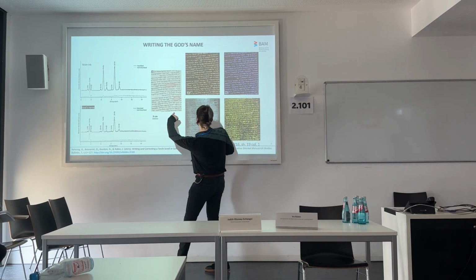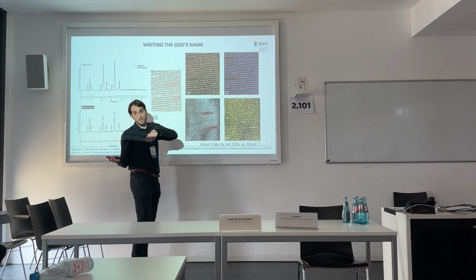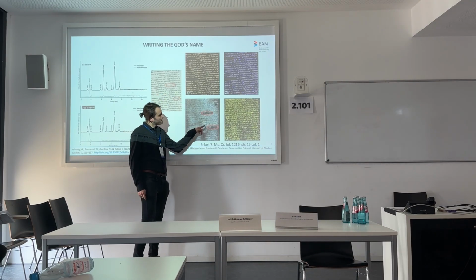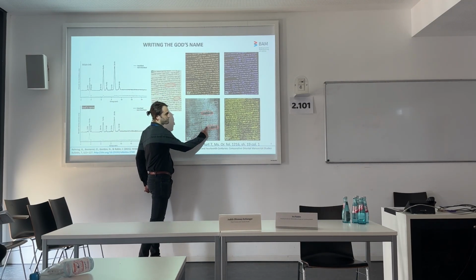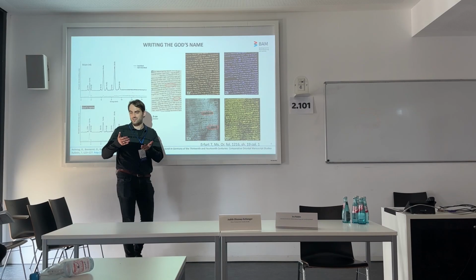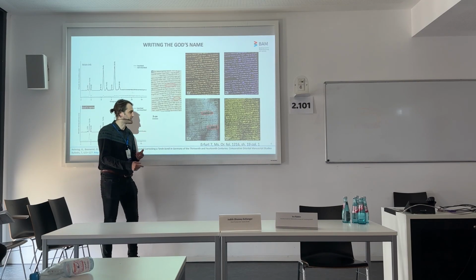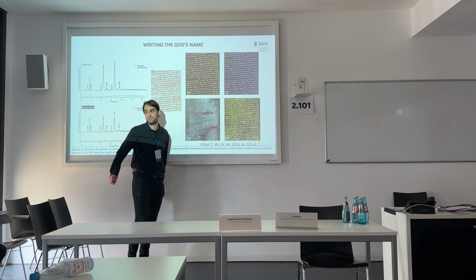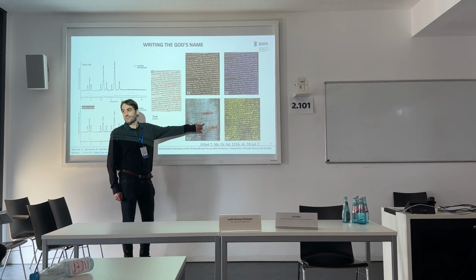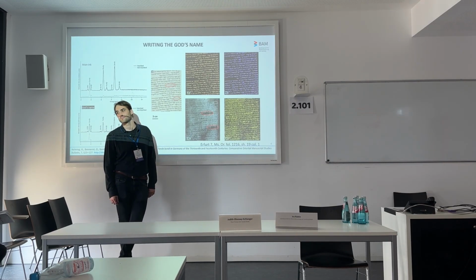So this area corresponds with what Nehemia was showing in his presentation. This seemed to him to be a correction, and in white we have the God's name. The corrections are here introduced over an area of the amount of calcium being reduced in the parchment. By reduced, it was scraped off. If you scrape the parchment, you reduce the amount of this element in the parchment. Therefore, it appears black is coming from scraping, from some mechanical action. But the whites, there was no scraping. No, because they were left blank. The inks were the same, so they show up in the lower right with the copper.